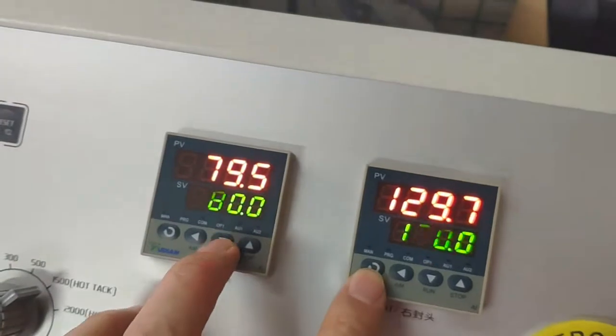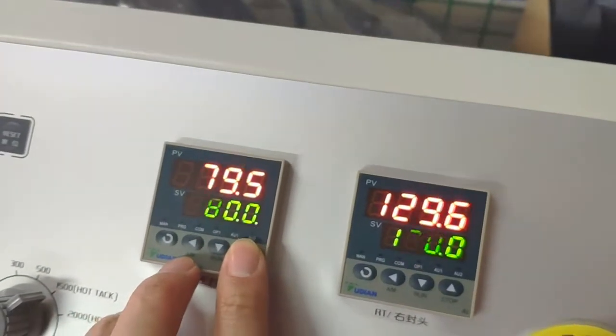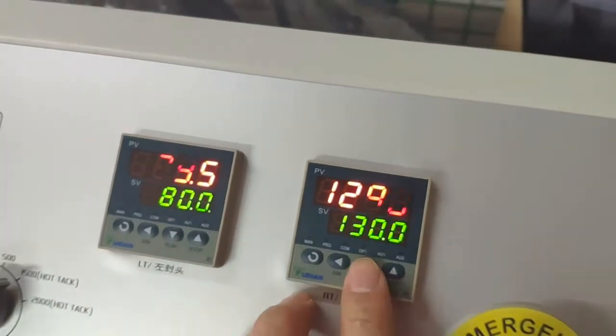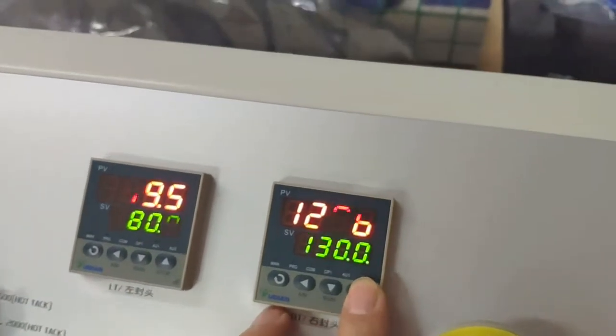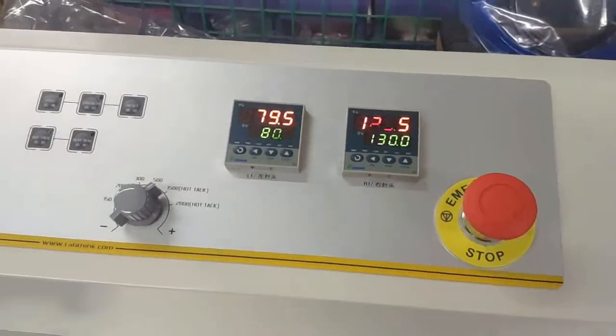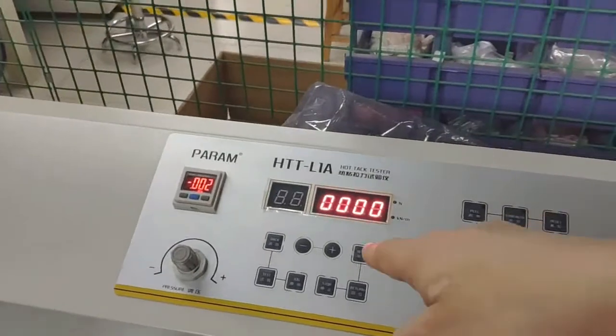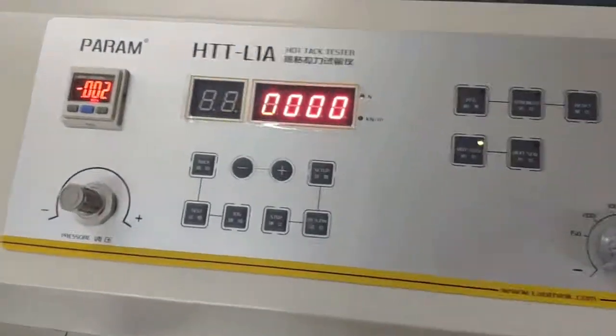These two controllers are very easy to operate. Use these two buttons to decrease and increase the values. Adjust them to the required values. This is the operation for temperature. Now for the operation of the test parameters.